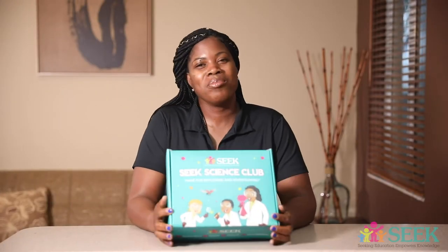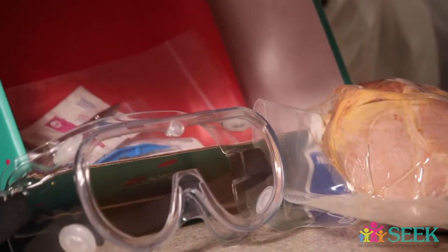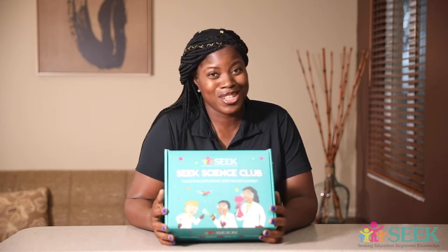What materials are you going to need? Well, we have all of the materials right inside of our SEEK Science Club monthly subscription. So we are going to see what materials are in here to dissect a heart — a mammal's heart of course, but not an individual person. So let's move over.